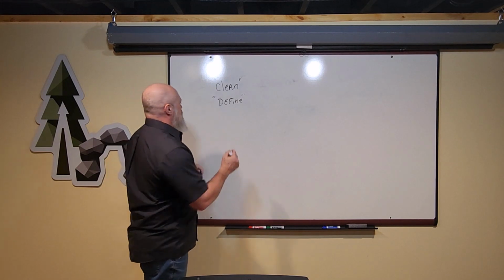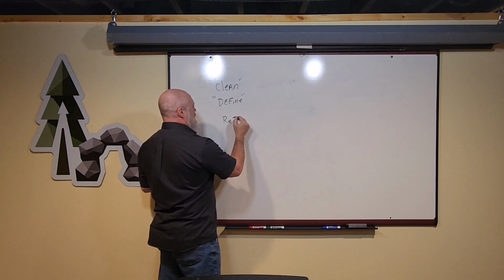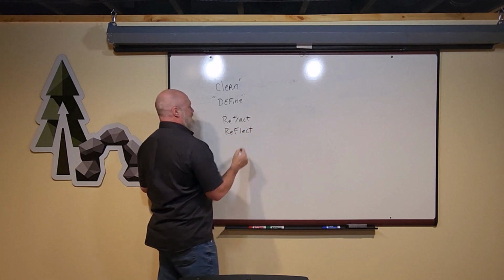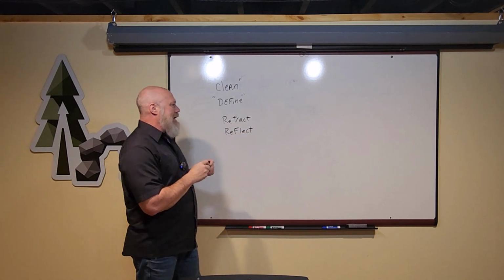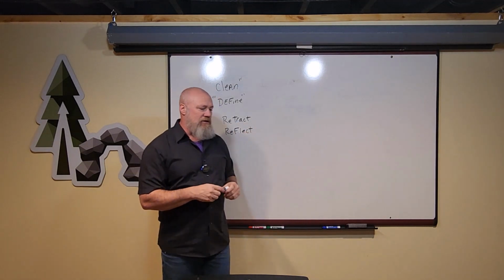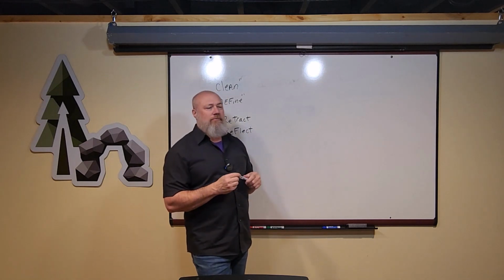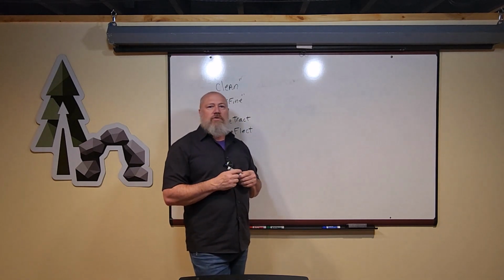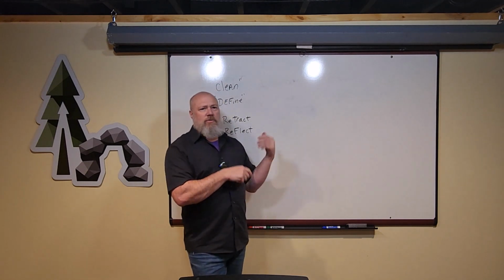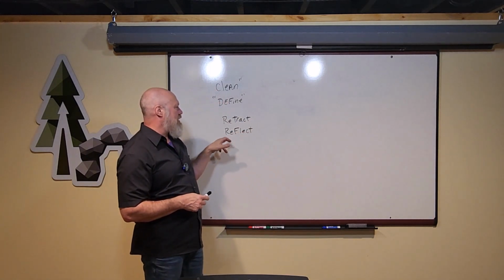Now, a couple other terms you might come across that can be confusing will be retract and reflect. Retract is going to be the temporary displacement of a structure. So the instructions you're reading in your lab may say use your hemostats to retract the pec minor so you can visualize some sort of structure, or the pec major to visualize the pec minor's structure. Retract means temporarily displace that structure so you can see under it.